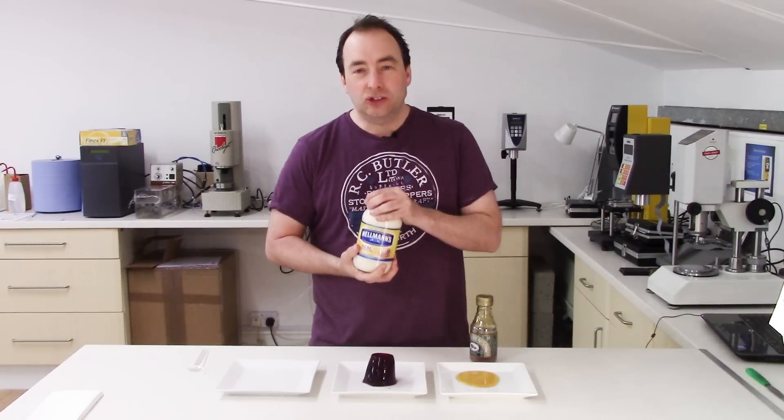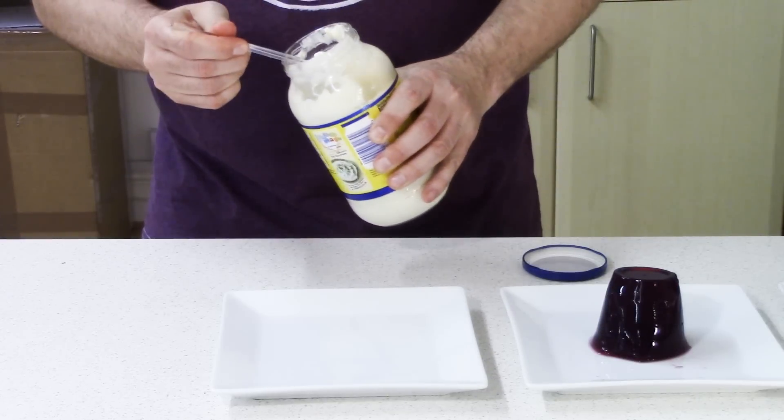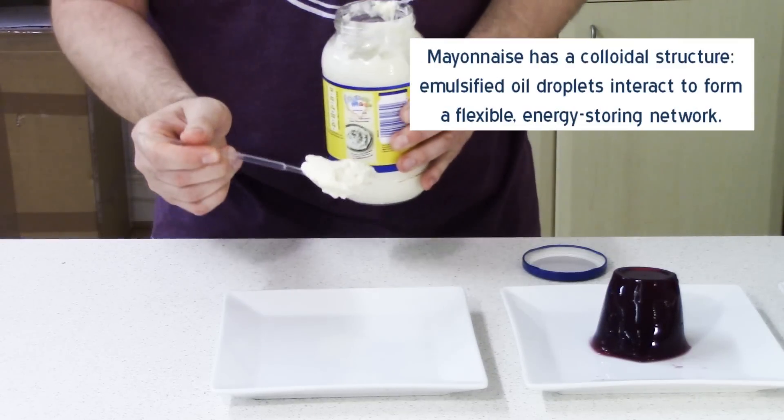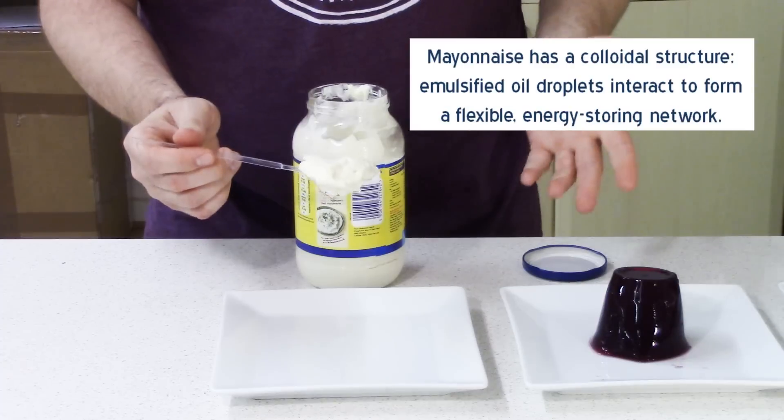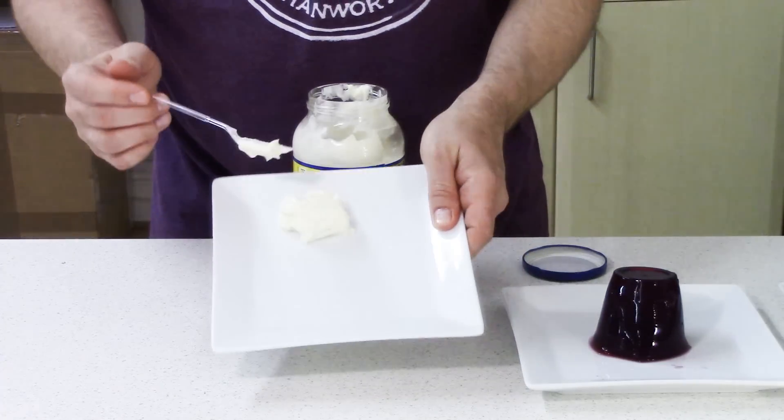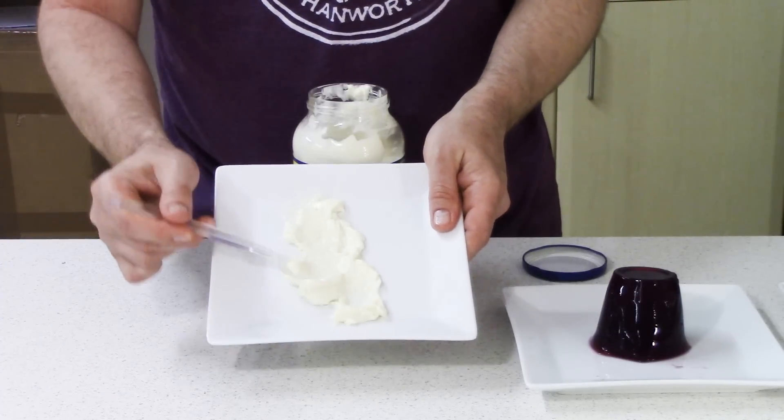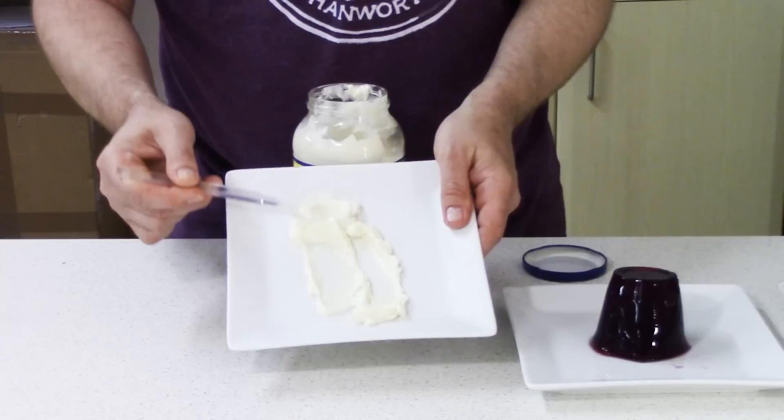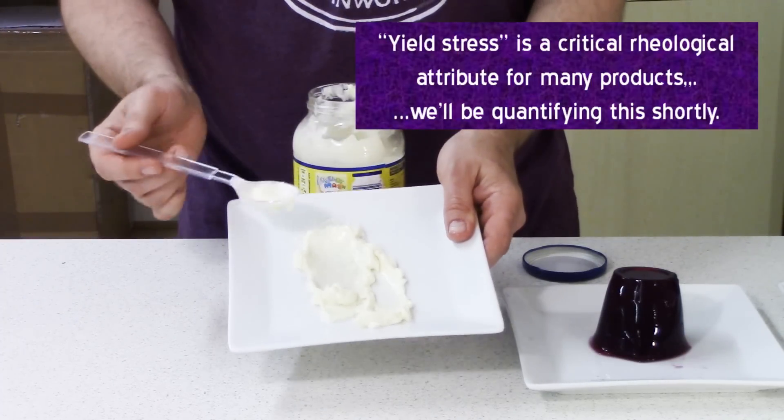Mayonnaise lives the double life of a structured liquid. Under low stresses, its structure remains intact, and that's why we can see the wobbling that we see in the jelly through elastic deformation. But when we apply sufficient stress to it, we disrupt that structure and elicit liquid-like flow behavior, albeit briefly, and it pretty quickly returns back to being the soft solid that we started with.